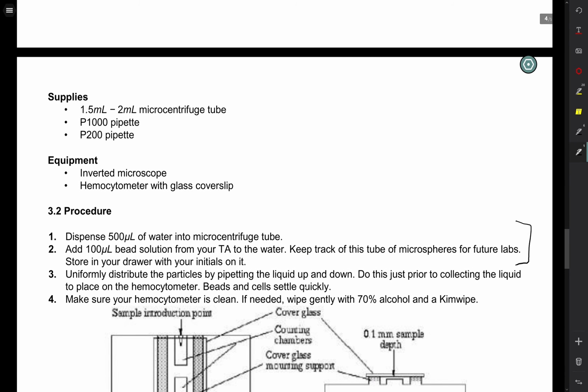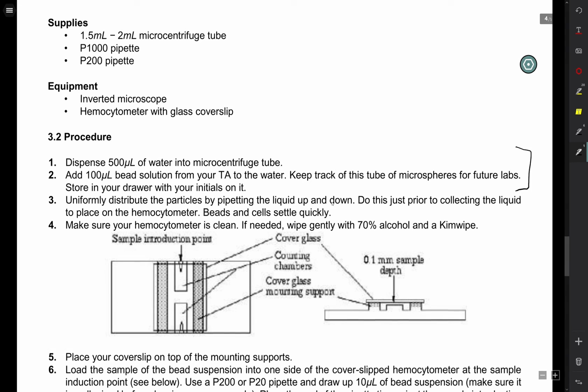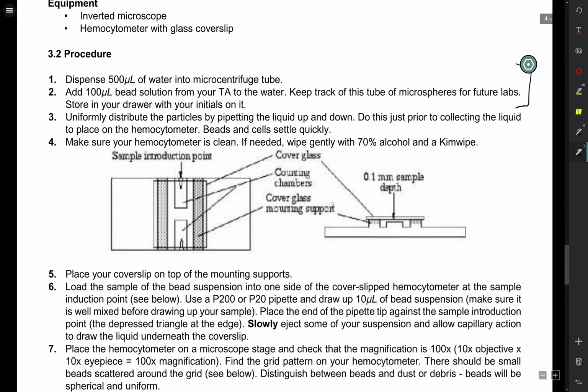One thing I do want to emphasize here is that whenever you're pipetting beads or cells or any solutions containing solids, make sure that the solution is well mixed prior to pipetting and removing it. If you don't, you're actually going to end up getting a not very well mixed solution, and it won't be very repeatable. Your TA will emphasize this in section as well, so please do so.